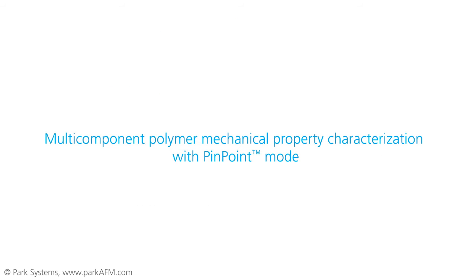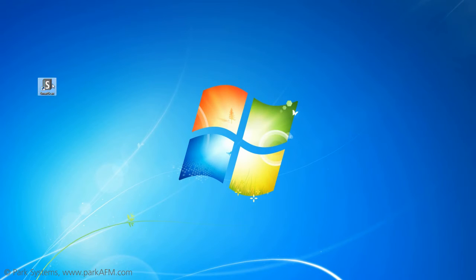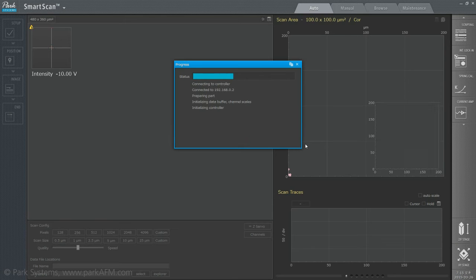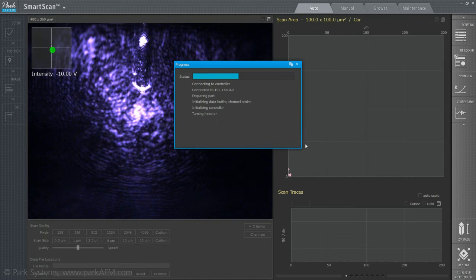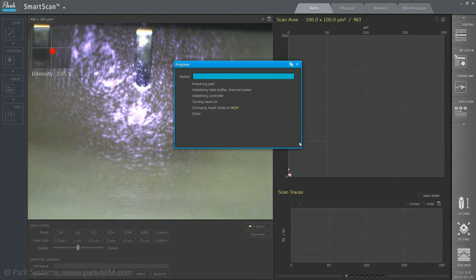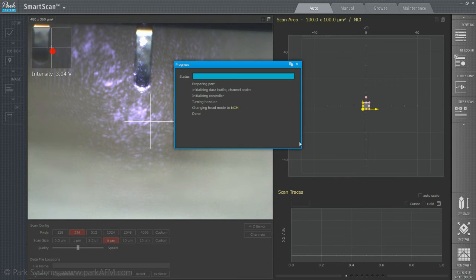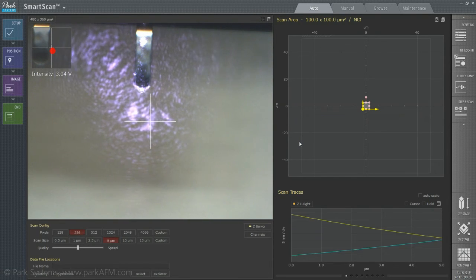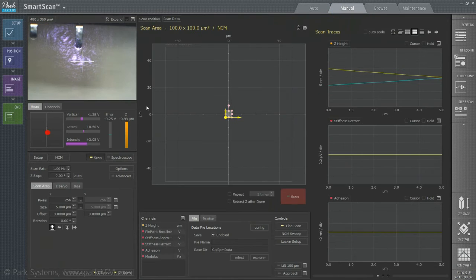Now, let's take a practical look at how Pinpoint imaging works on a Park AFM. With Park's AFM OS, Smart Scan, anyone can achieve high-quality nanoscale imaging with auto mode, and in most cases, this mode is all that is needed. However, in the case that more precise control is required, Pinpoint imaging can be operated in Smart Scan's manual mode.